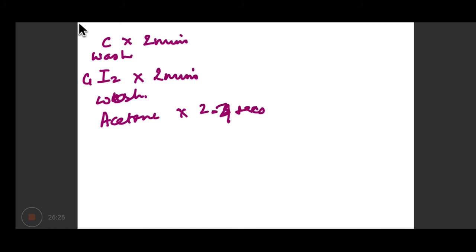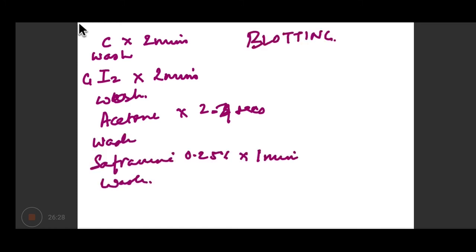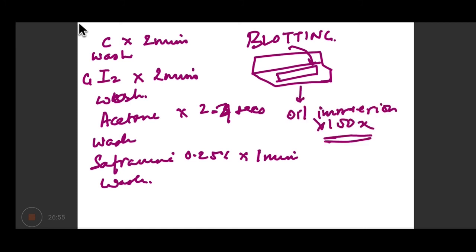How do you blot dry? You have blotting paper. This is a folded part of the blotting paper. You keep the slide here. You fold this over the slide and tap it, and then your slide will be blotted dry. And then under the oil immersion lens of the light microscope, which is 100x, you are going to see the stained slide.